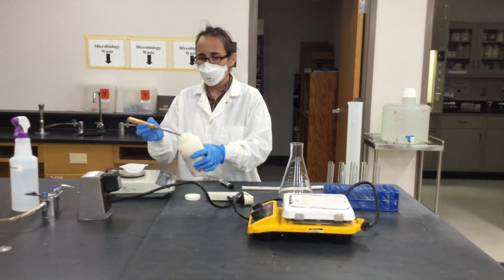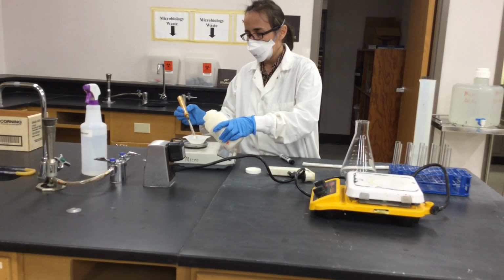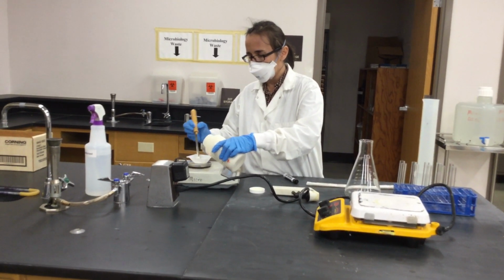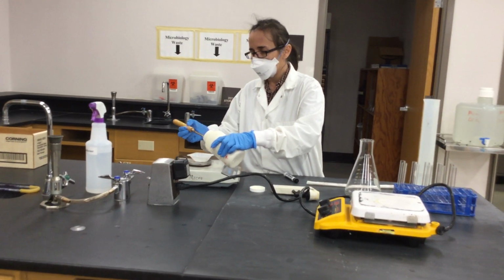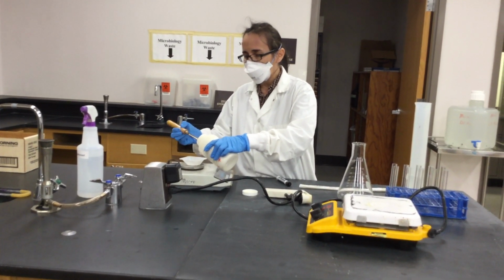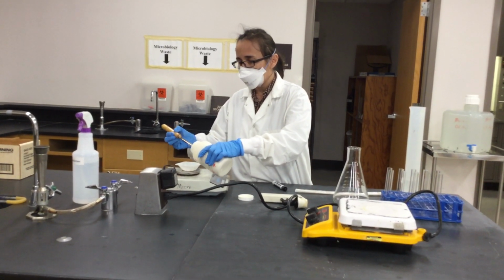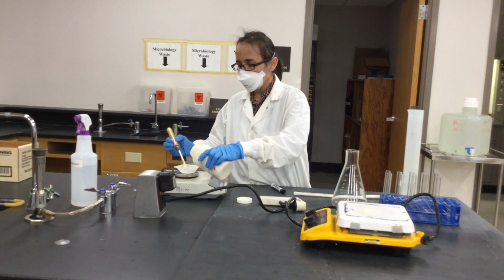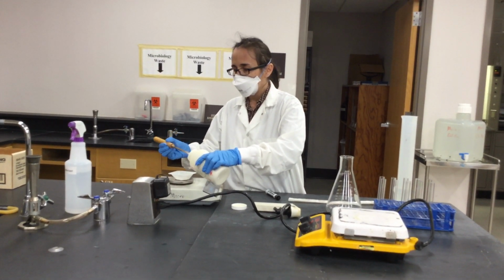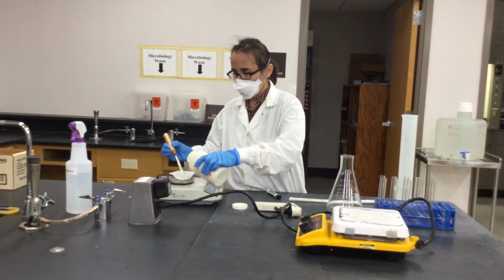You can start seeing how it's very powdery, and kind of work quickly as you're measuring your 4 grams, because this media is hygroscopic, meaning that it's going to grab water from the environment and it's going to start forming little rocks of media, which is not very advisable because you have to dissolve it.